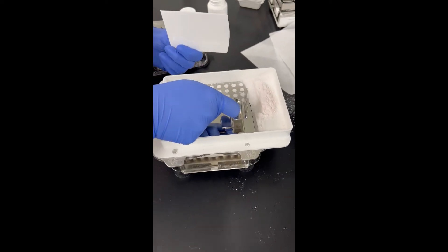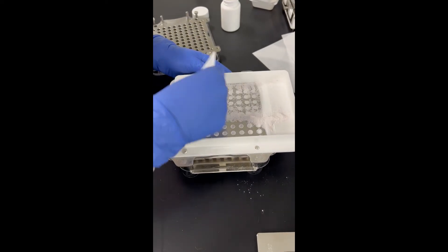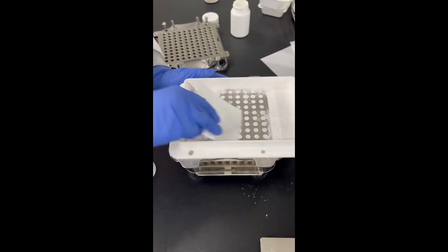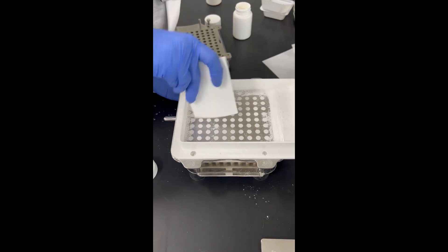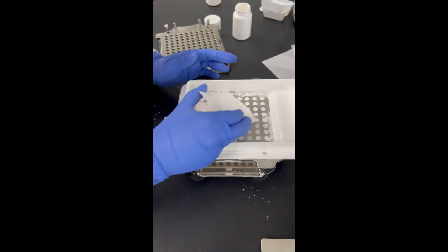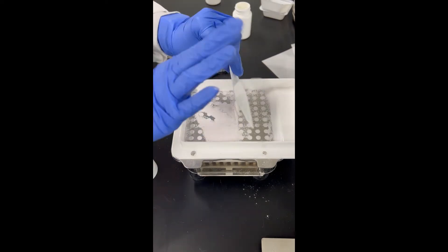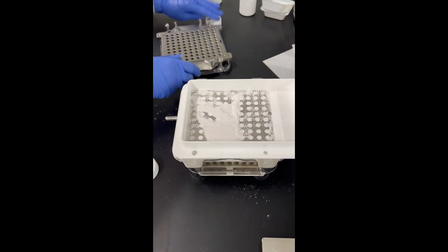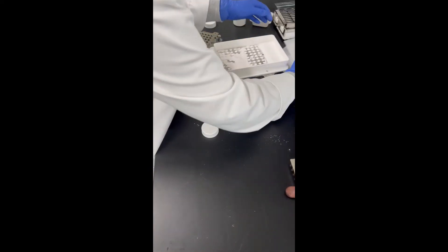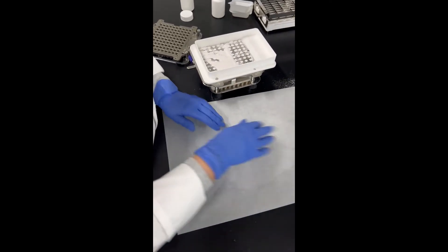I'm just going to do it one more time to get a little bit more in there. Since I have quite a bit of powder left over, I'm going to put that to the side. I'm going to scoot this over and put my parchment paper here just so that I don't get powder everywhere and have to clean it up.